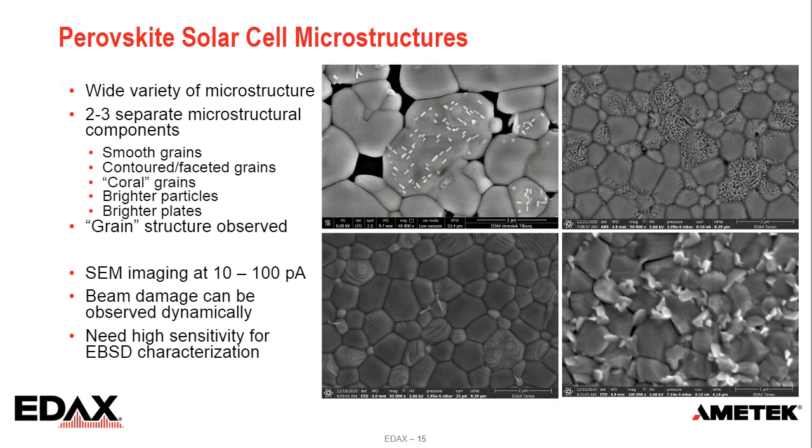But what I want to point out is in the bottom right image, somewhere between 1/2 to 2/3 of the way through to the right, there's a vertical line. On the left-hand side, before this image was taken, that area had been imaged previously. Then I took another image where I got part of the image that had been imaged previously with a fresh area. And you can see on the left of that, there are some gaps between the grains. We've seen a change in the microstructure due to the beam exposure from imaging the sample.